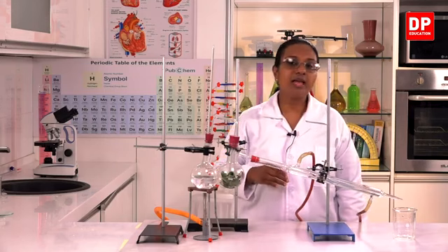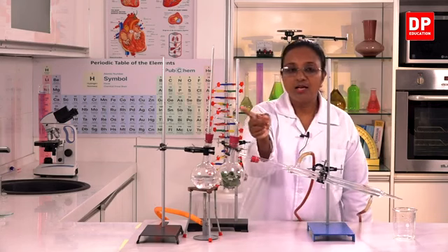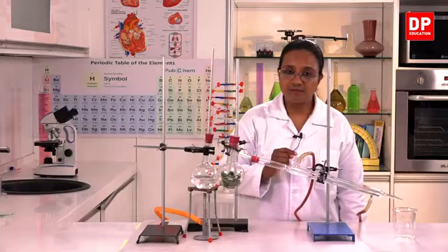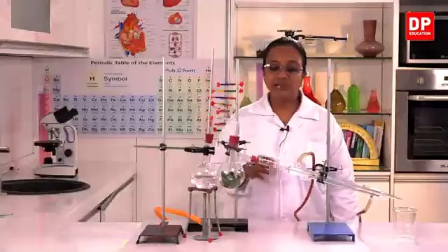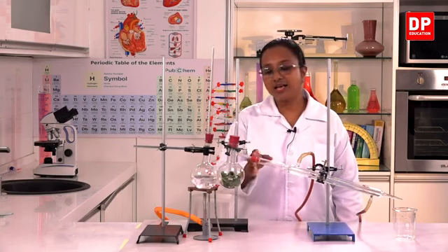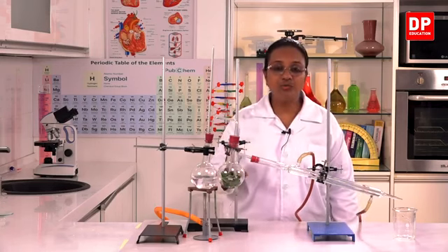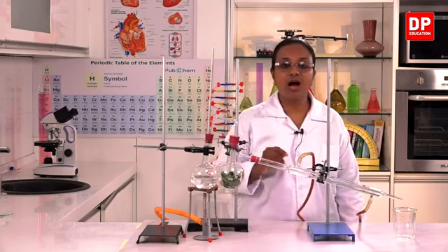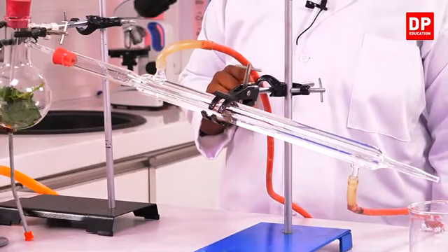So I will be extracting cinnamon oil. Then from the first flask, steam enters into the second flask. So due to the heat of the steam, the volatile compounds that are present in the leaf will turn into vapor, and the vapor will escape through this outlet, and that is connected to the Liebig's condenser.